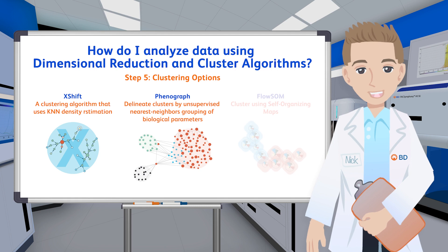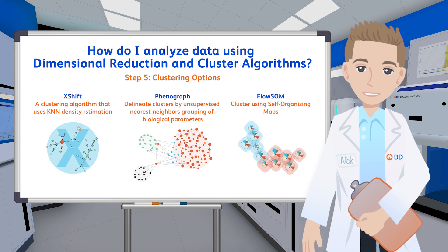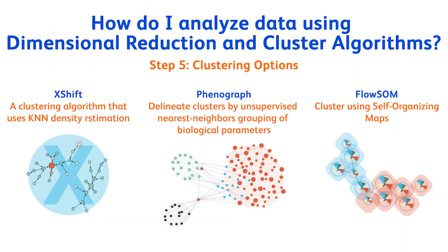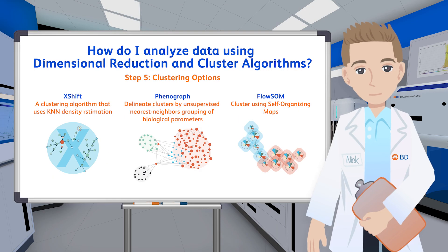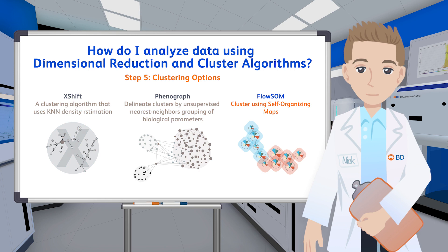Dimensional reduction and clustering go hand-in-hand — one is not incredibly useful without the other. We use clustering algorithms for two reasons: first, to parse the data faster, as the algorithm will identify all populations present in the dataset normally within minutes versus the 17 hours mentioned earlier; or second, to get a fresh perspective on the data. All algorithms have their pros and cons, but the most used in the field currently is FlowSOM. FlowSOM uses a self-organizing map and k-nearest neighbors to generate cluster populations.